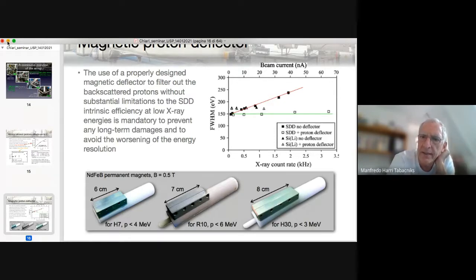It's more or less like the physicians that use nuclear resonance on your leg, but they don't look at the spectra, they look at things similar to X-ray radiography. And they don't want to know the details of the machine. And I think we need to improve a lot the data analysis to get results that are acceptable and quick. Is that more or less right?